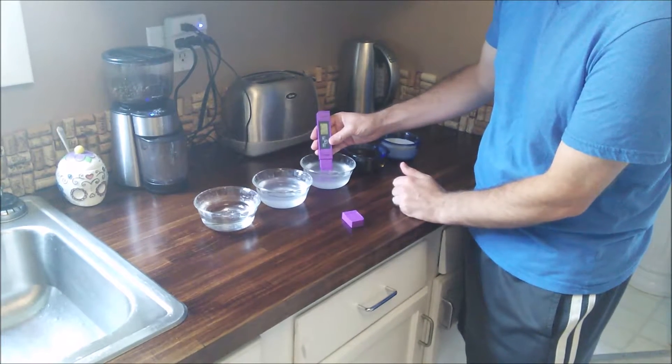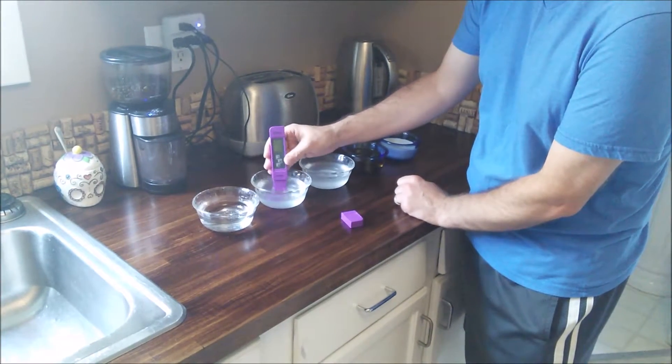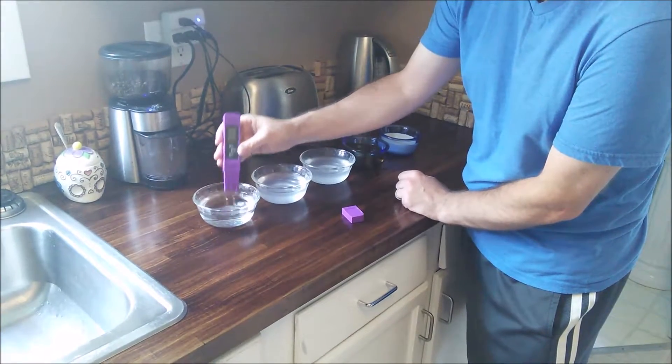The salt water is probably going to give me an error again — and yes, ERR. So you cannot measure that. Let me rinse this off again and make sure I'm back to zero. Back to zero.